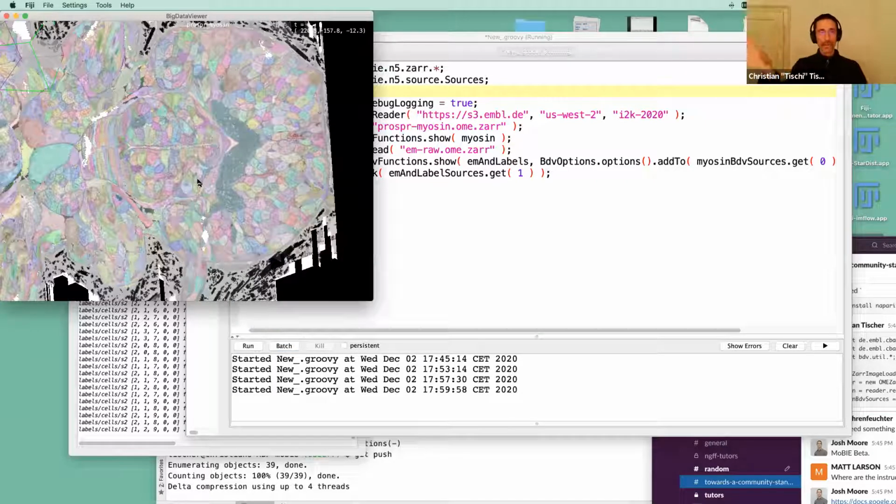Even cooler, of course, with Viewer, when you can just do this in the internet or in Napari or whatever. I think the point we want to make with this workshop is that it works in all, we think, three major platforms, and it's always the same data model, which I think is quite exciting.